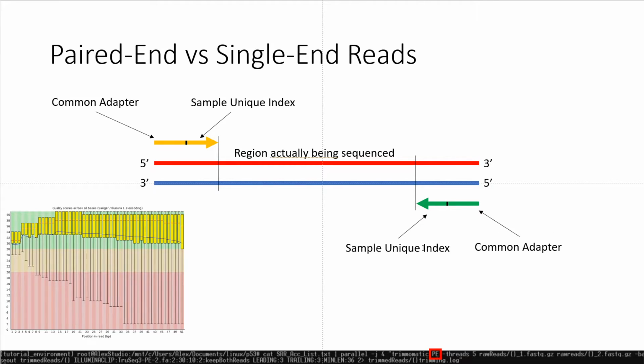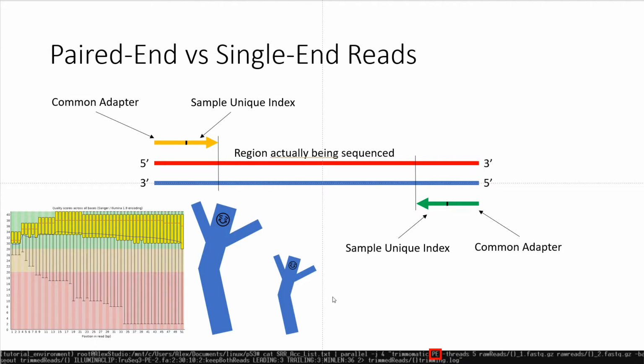This is probably not the right way to think about it, but for quality of single end reads, when you have really long reads, I think of it like the inflatable man. When he's flopping around, you have more unknown towards the ends, and as it gets closer to the chip, the quality is better than really far away. So with shorter reads, you can have better quality. What we're working with, we have 51 base pairs, so it doesn't really have a whole lot of wiggling around, I guess, but that's another thing to maybe consider.